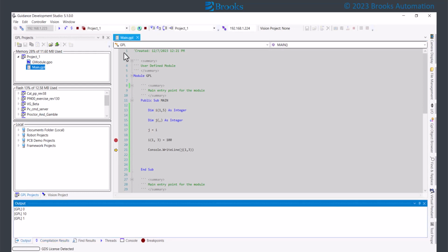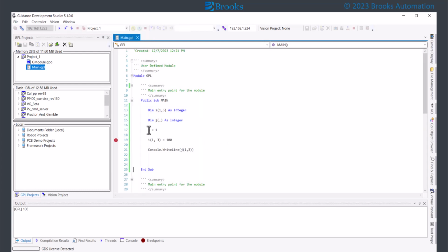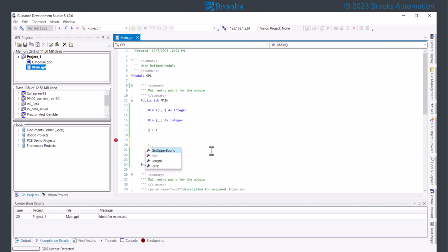modified value. When single array elements are passed as procedure arguments, they behave the same as non-array variables of the same type. Whole arrays can be passed as an argument to a procedure. In this case, the behavior is the same as when passing objects. A reference to the array is passed and any changes to the array within the method are visible to the calling procedure. All arrays are members of the built-in array class.